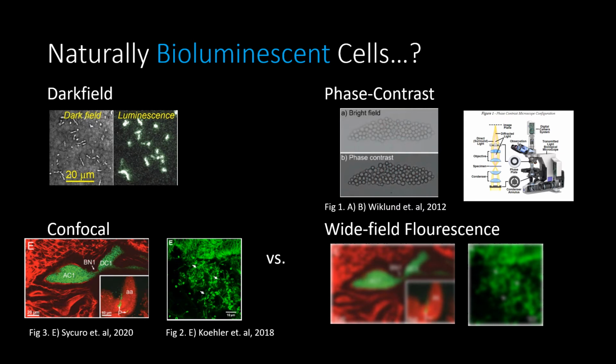Dark field microscopy is depicted in the top left, where Vibrio fischeri cells are illuminated by both an external light source and their own natural luminescent emission. Both of these create greater contrast, allowing us to see the 2D shape, general structure, and natural bioluminescence of Vibrio fischeri.